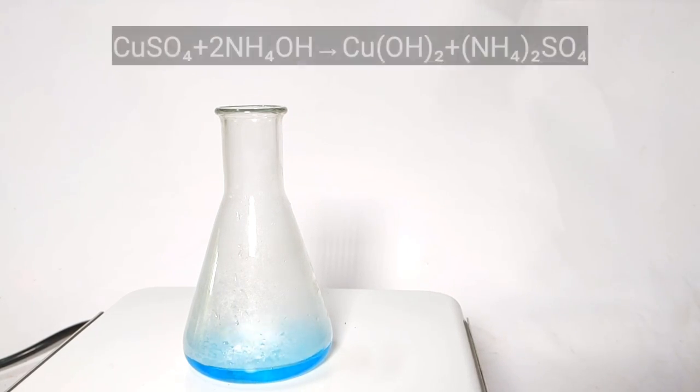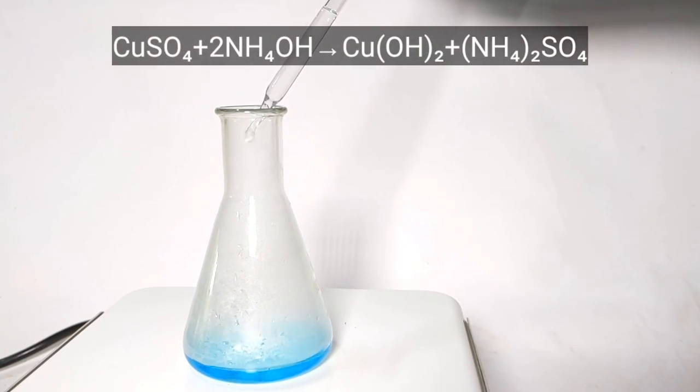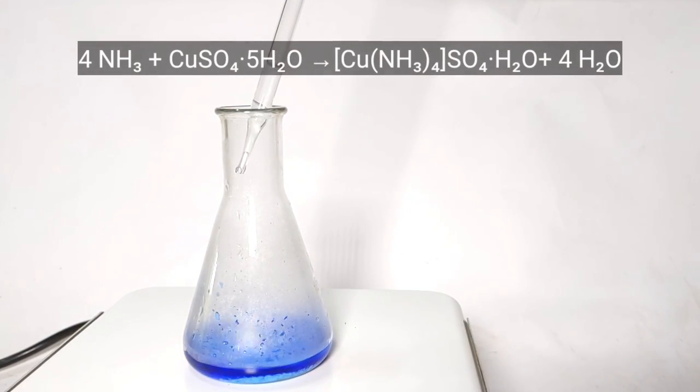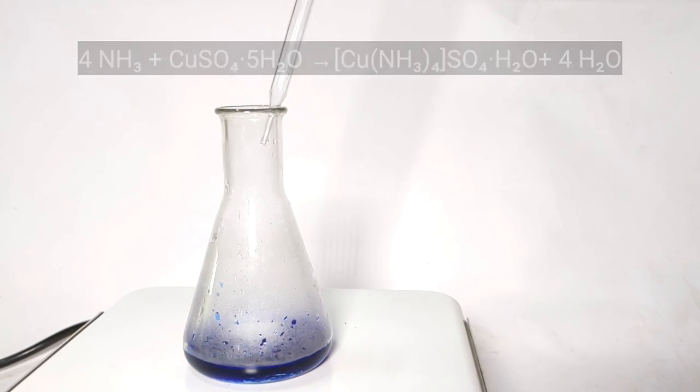Initially when adding the ammonia solution, pale blue colored precipitate of copper hydroxide is formed. But when ammonia becomes in excess, everything clears up and the solution turns deep blue, forming the tetramine complex.